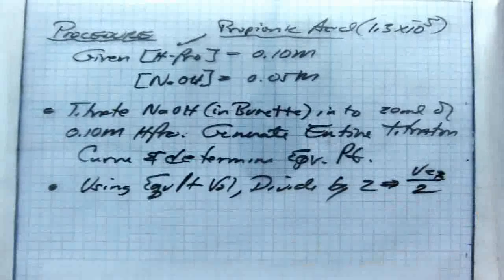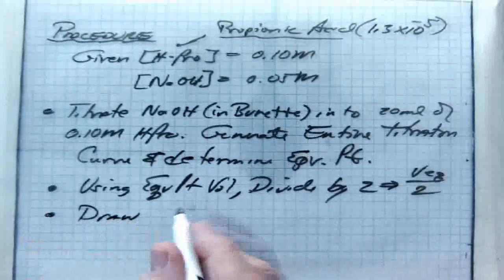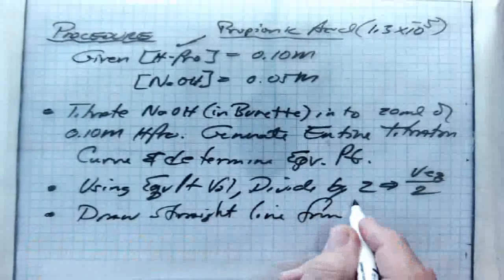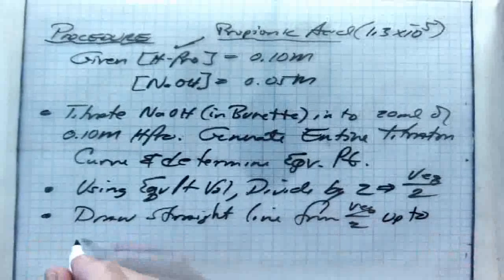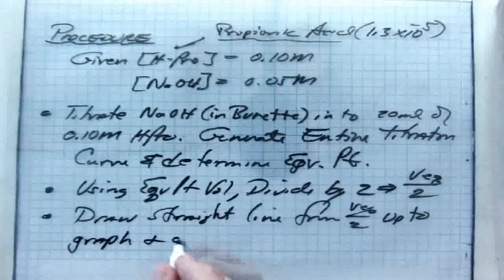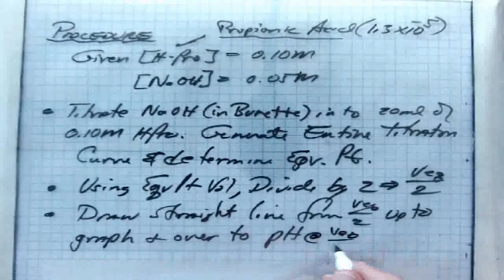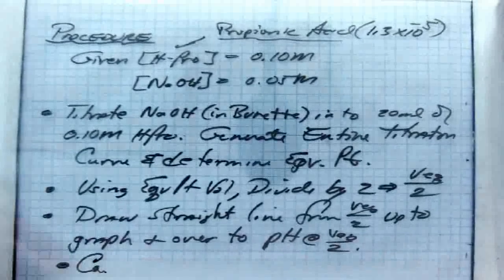Your conclusion: the Ka, the experimental Ka, was found to be blank, giving a RR of blank to blank. Percent error is calculated like that in your error analysis. Period. That's it. Now y'all will be able to handle that in your group pretty quick.